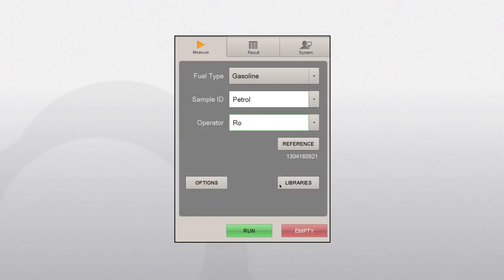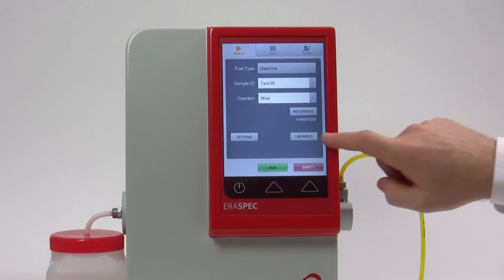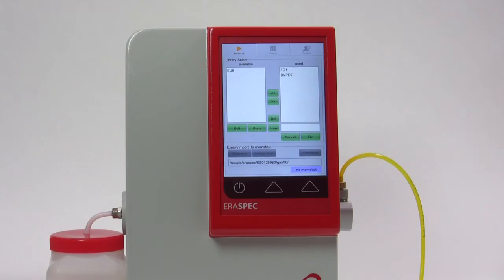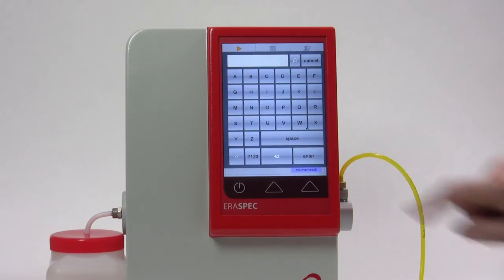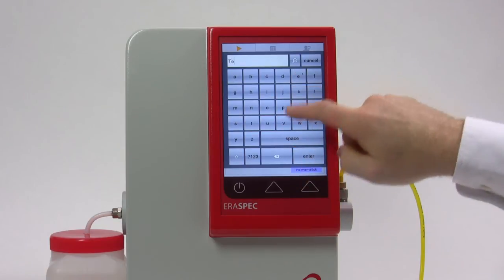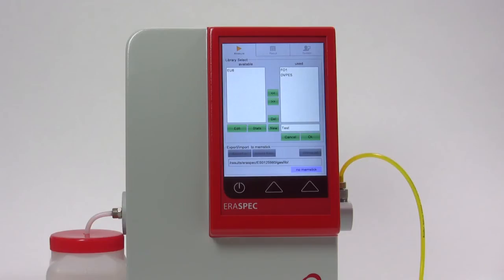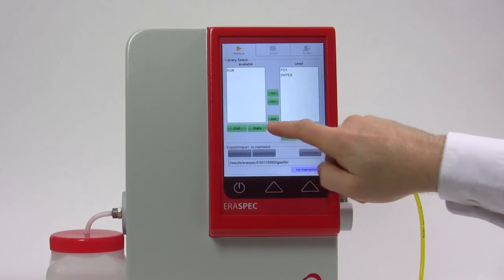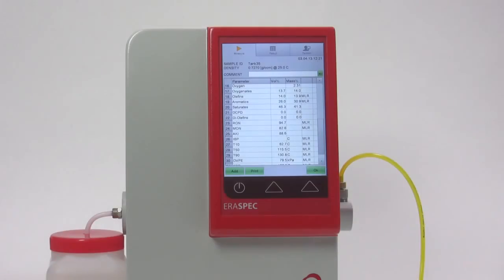For best accuracy, it is recommended to create new libraries with your specific samples or at least add typical samples to the existing libraries on the ERASPEC. Enter the name of the new library and press the button New. It is possible to add a sample directly after a measurement by pressing the Add button or at any time later from the result memory.